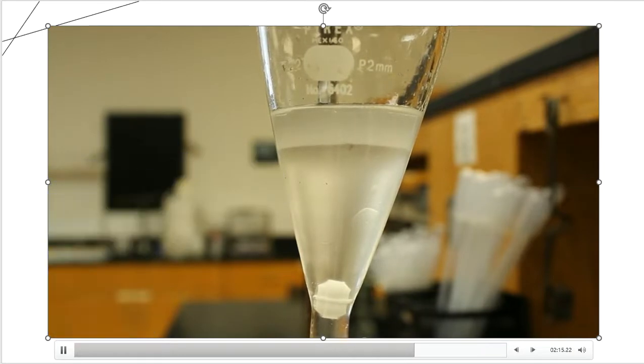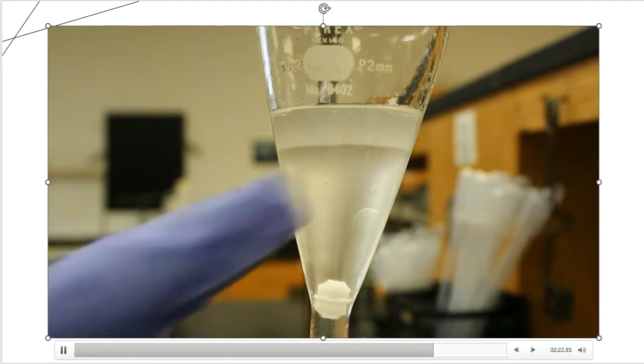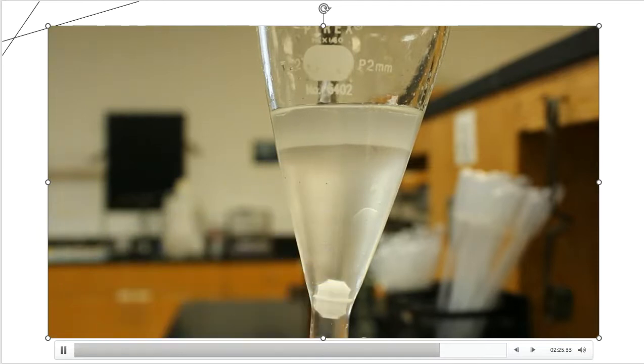All right, so I think that you'll be able to determine which layer is which. So I'm going to have to drain off the water layer, meaning that if the methylene chloride is here at the bottom, I'll need to drain that off, capture it, and then funnel out the rest of the water and get rid of it. Or if the water is at the bottom, I just simply have to drain the water off and call it a day. So use your judgment, figure out which layer is which. If you're unsure, take a look at density, but I'm going to get rid of the water layer, and I'm going to put the methylene chloride layer into the separatory funnel in the next step.